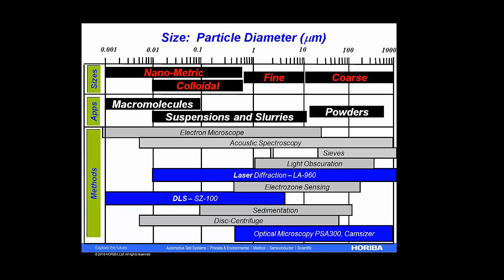Laser diffraction is a bit entertaining for a few reasons. One, it's been around a long time, and so there's a nice history to it. Second, the technique is extremely fast, and so you can really get data much more quickly than almost any other sizing technique. And third, the size range is very wide, and so it really spans the range of several other techniques, and so that makes it tempting, particularly if you expect your needs will shift in the future.